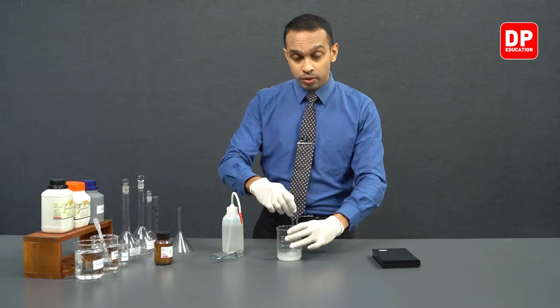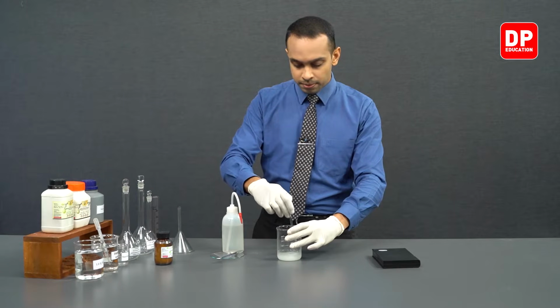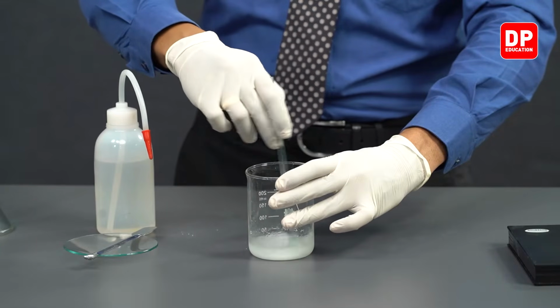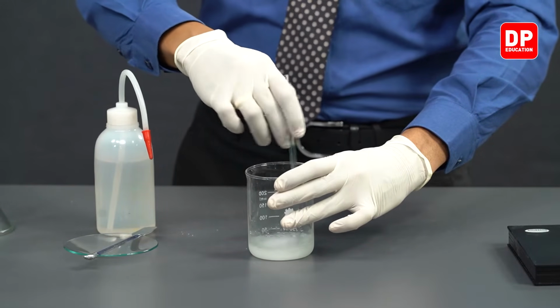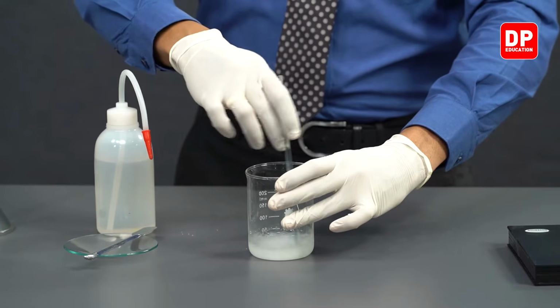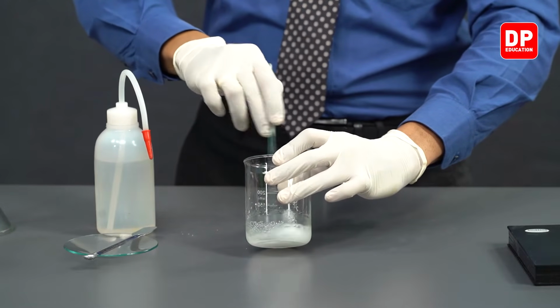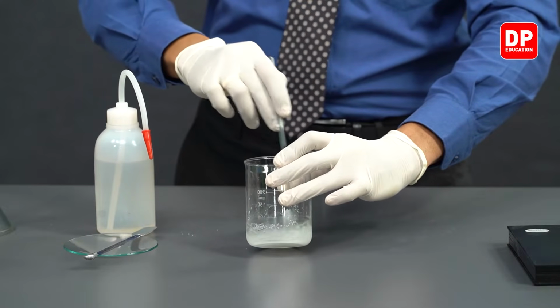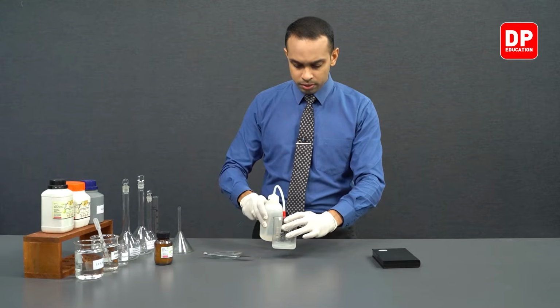And then we will transfer that into our volumetric flask. We'll have to add a little bit more water.